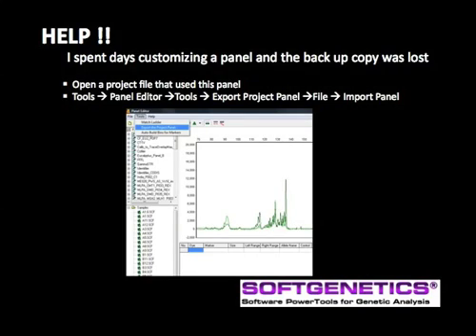Of course, the best practice is to back up custom panels, saving them to the data analysis folders.